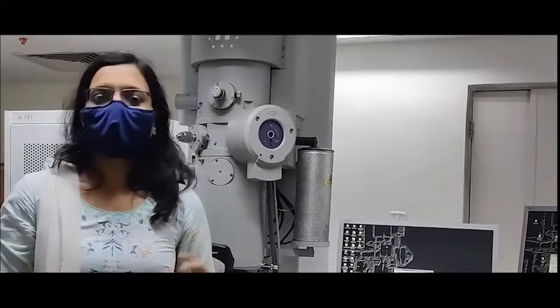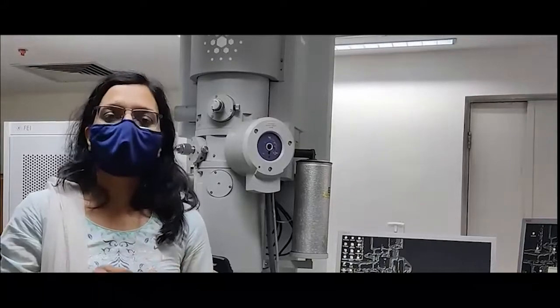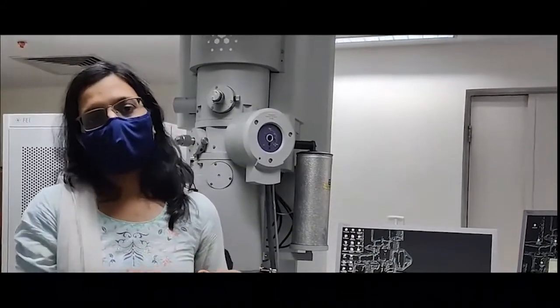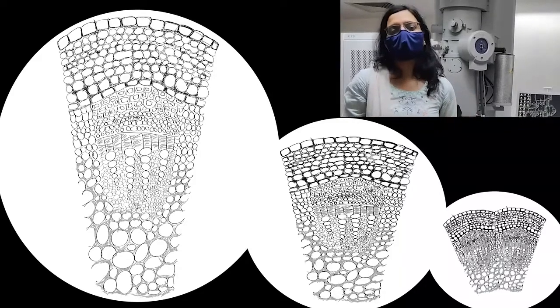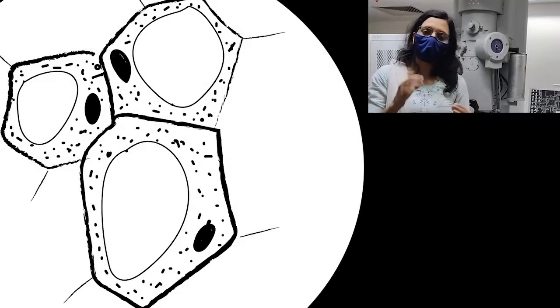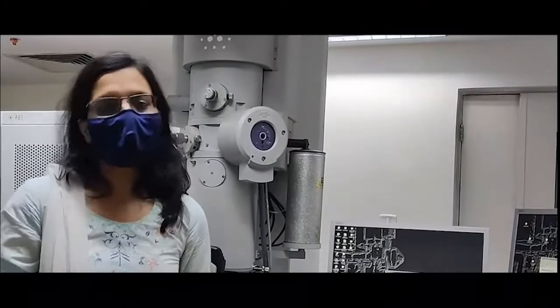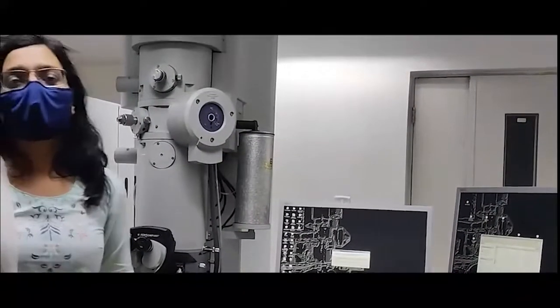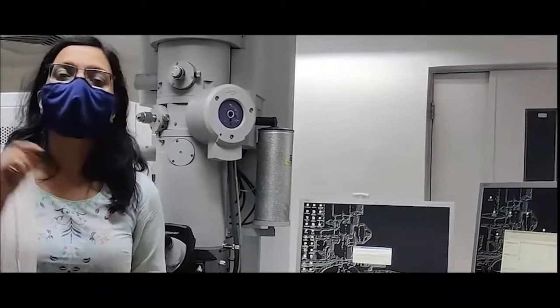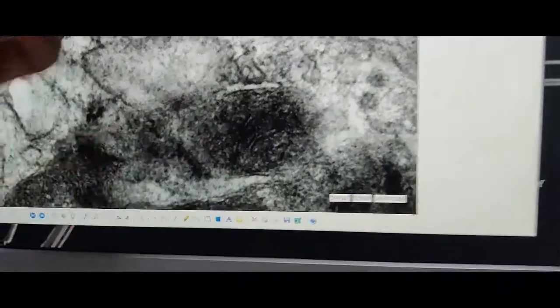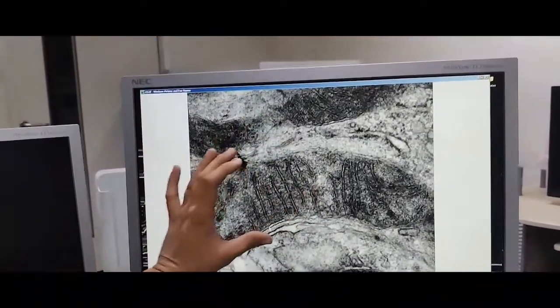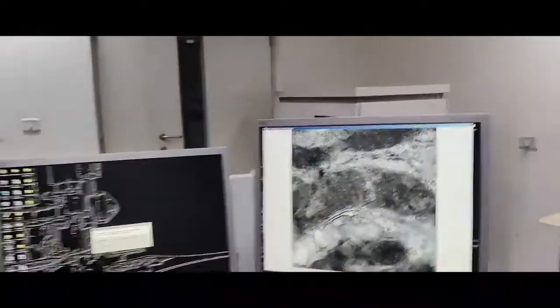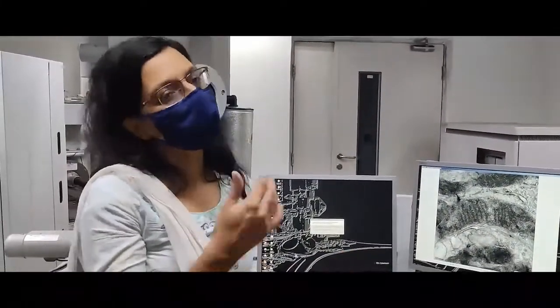The typical magnification, first I will talk about the magnification. The typical magnification that you see under a light microscope or a compound microscope as you call it is 10x, 20x and 40x objective lenses. Most of the microscopes provide you these three objectives. And there are some microscopes which can go even up to 100x using oil. This one actually gives you up to 700,000 times the original cells. The x here is only 5000.